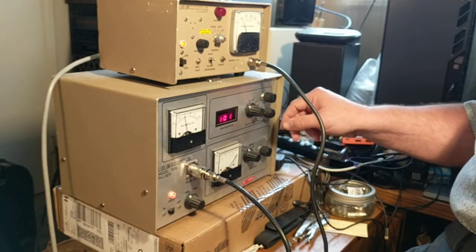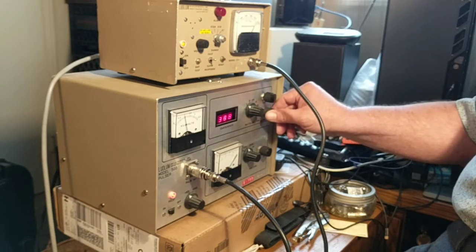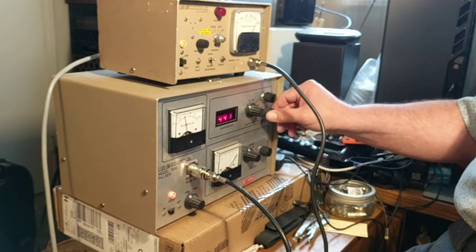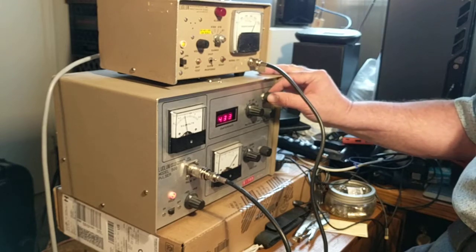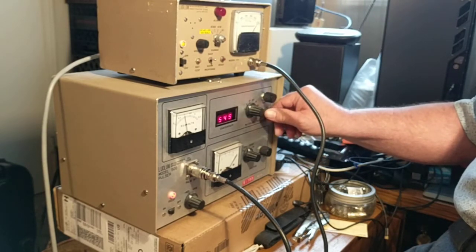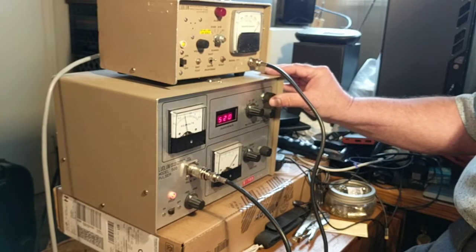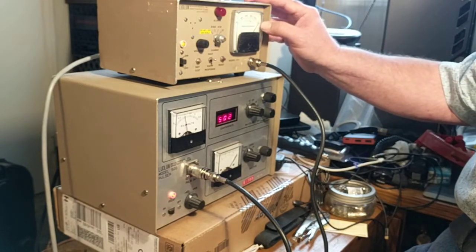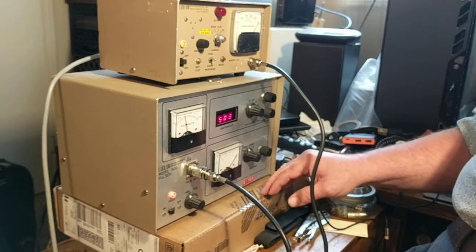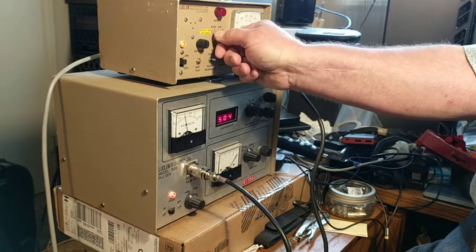Let's go to 500 — that's a coarse tune and here's a fine tune. About 500 counts per minute right here. Now let's go to a higher scale — 5,000 counts per minute, times 10.